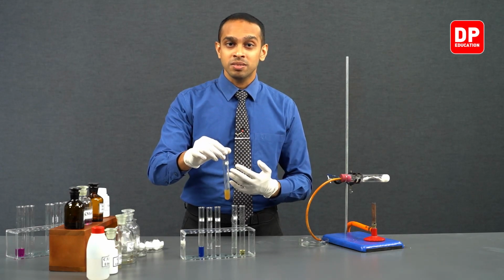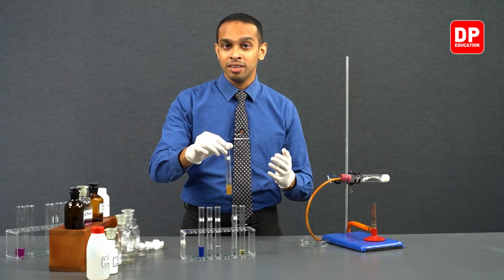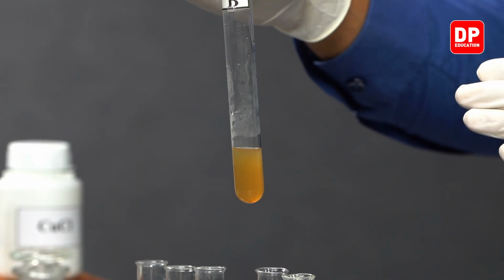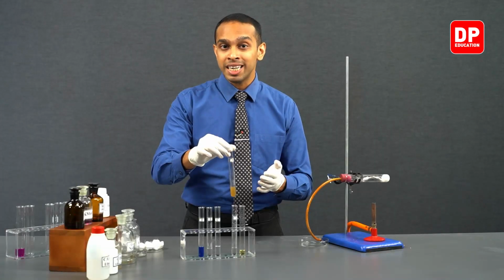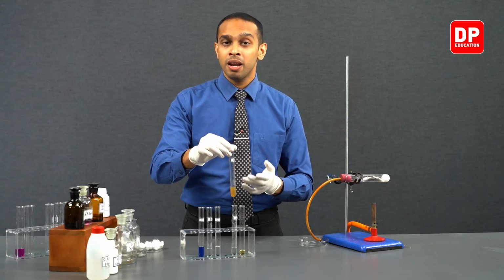As the ethene gas got oxidized, the potassium permanganate got reduced. Starting from permanganate ions that are purple in color, we observe the color of this test tube changing from purple to green first. That is due to the formation of manganate ions, MnO4 2-, which are green in color.